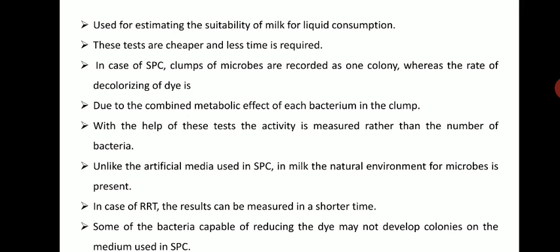Unlike the artificial media used in standard plate count, milk is the natural environment for the microbes present. In case of RRT, the results can be obtained in a much shorter time. Some bacteria capable of reducing the dye may not develop colonies on the medium used in standard plate count.